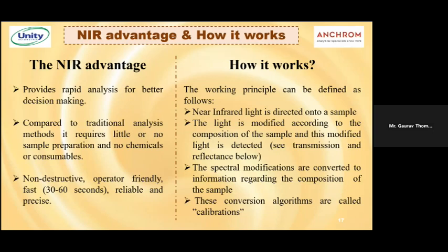So when it does this rapid analysis, doesn't use any chemicals, doesn't need any sample preparation, and does this non-destructive kind of analysis, let us see how this NIR works. What happens is the near infrared radiations, you would see here.